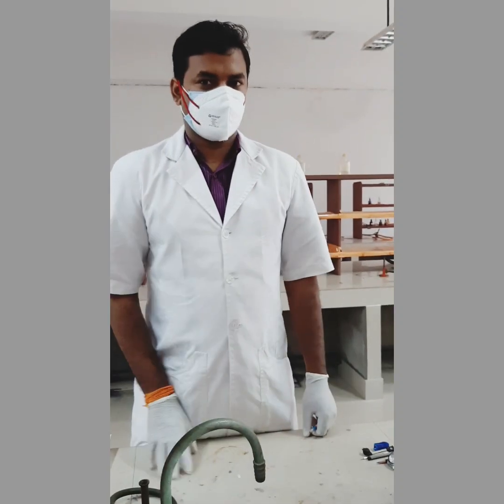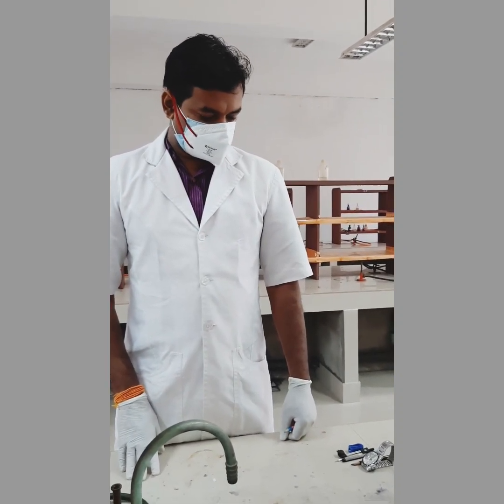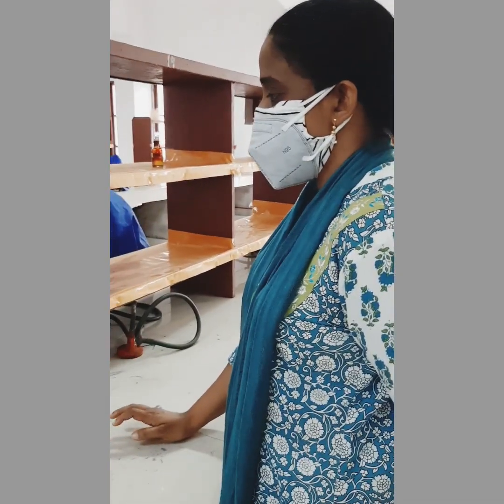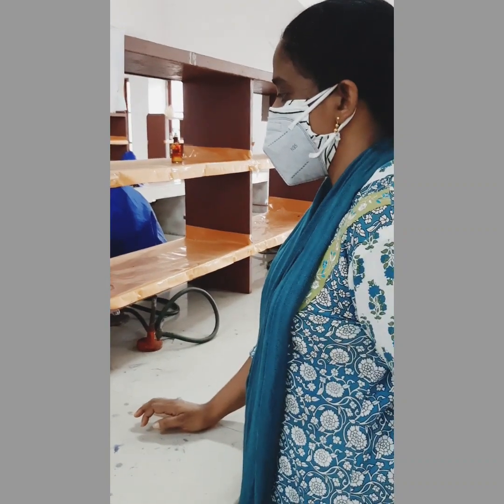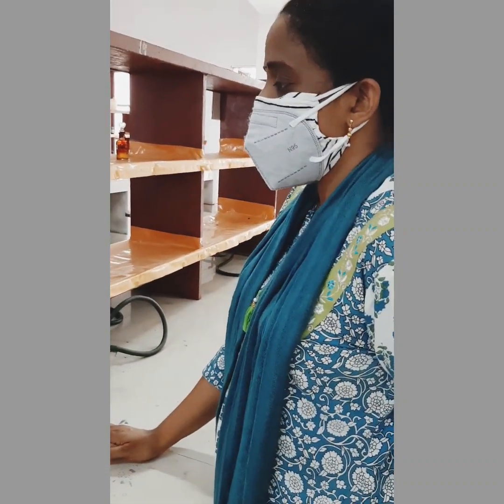Start with acid fast staining. Acid fast staining or ZN staining was introduced by Paul Ehrlich. It was modified by Ziehl-Neelsen, hence it is also known as ZN staining or Ziehl-Neelsen staining. It is mainly used for the demonstration of mycobacterium species.